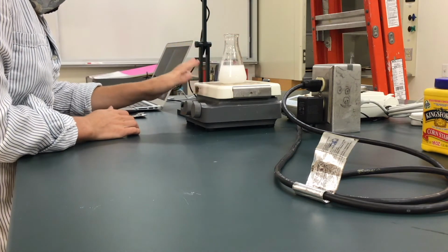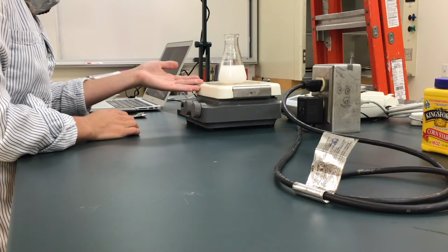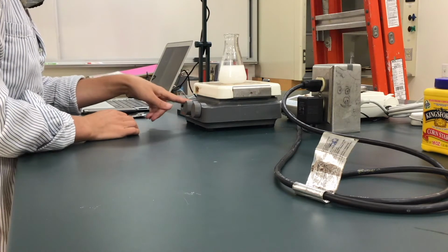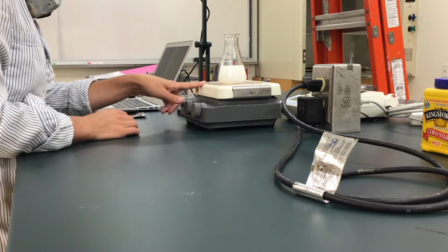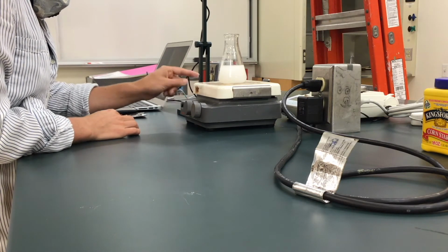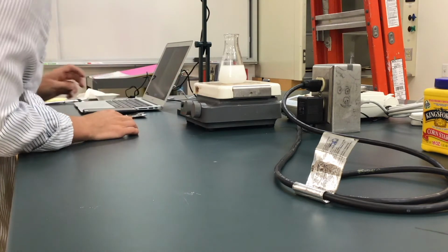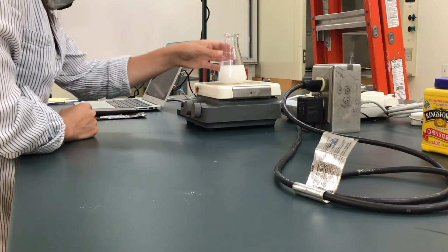I also don't have a method for measuring the concentration of cornstarch, but we could calculate it knowing exactly how many grams we used, which was 0.9 grams, and exactly how many liters of water, which is 75 milliliters. So we could work out this concentration of starch. But you'll see why we measured the glucose concentration in just a moment. Okay.